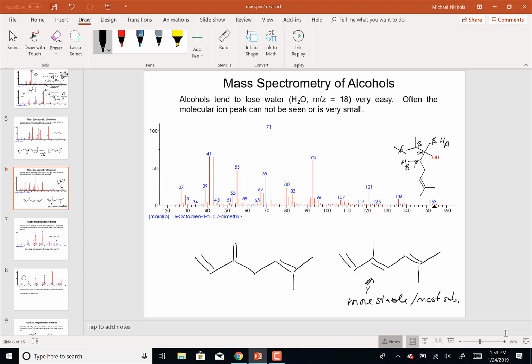So that's how alcohols always lose HOH. Just like in lecture, we talk about losing the H and the leaving group from the alpha and the beta carbon, and you're going to form the double bond that's most stable. See how much lecture stuff we reviewed here.